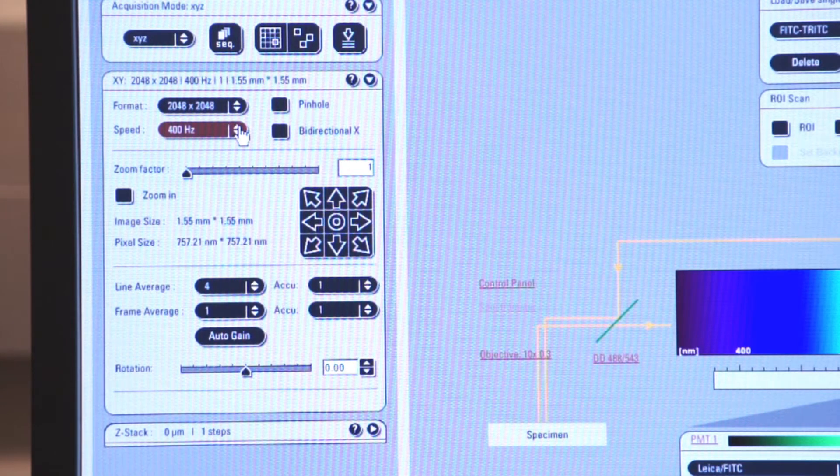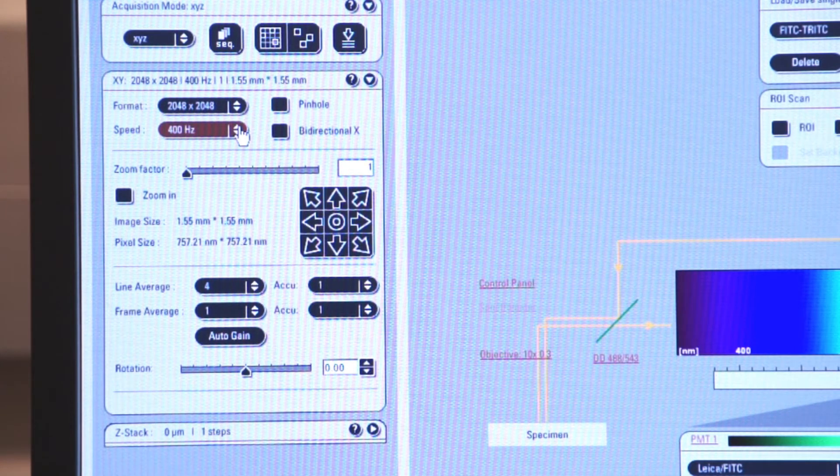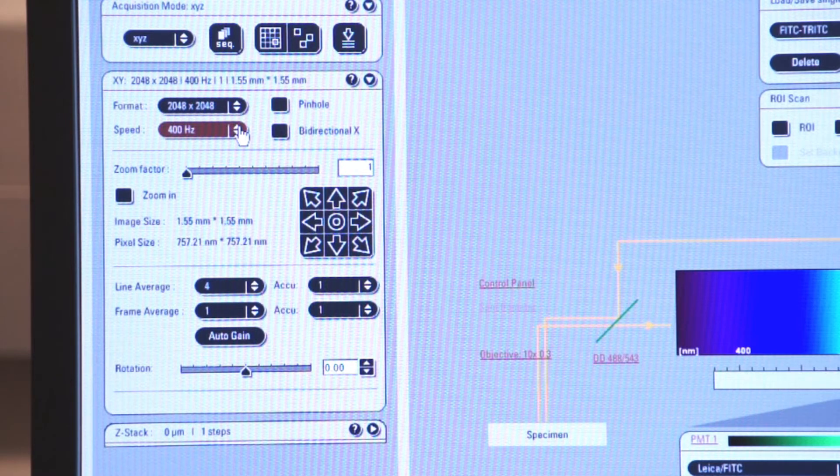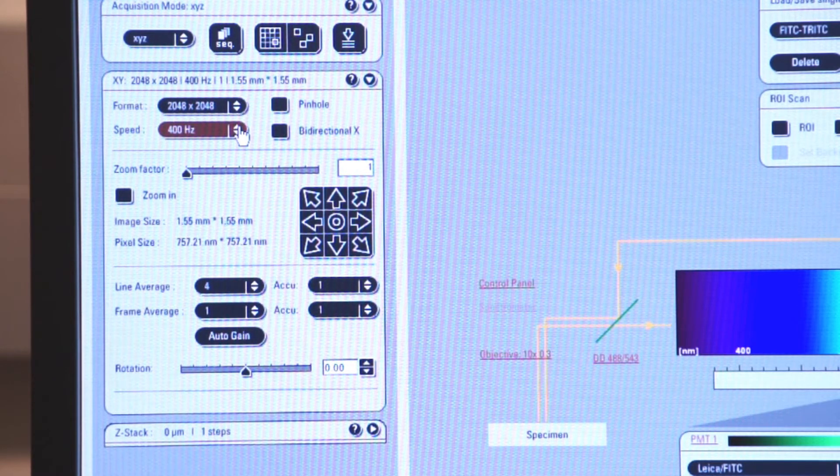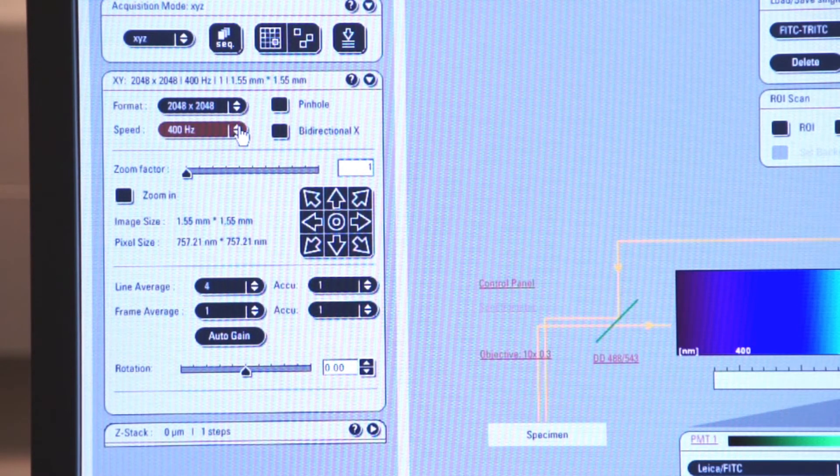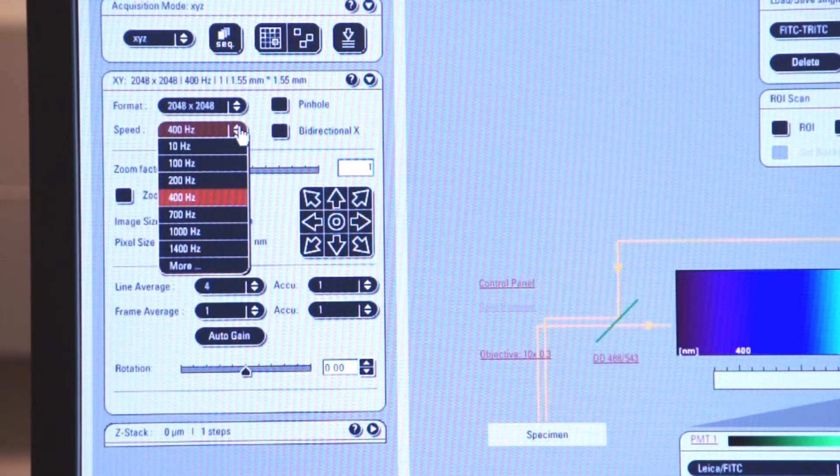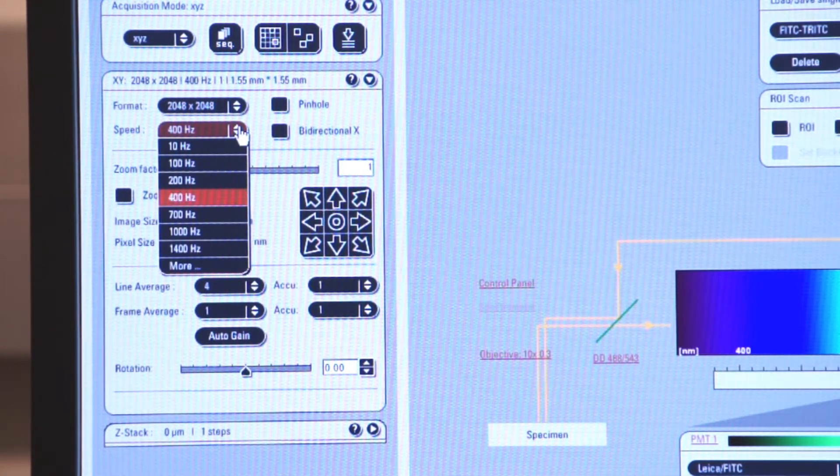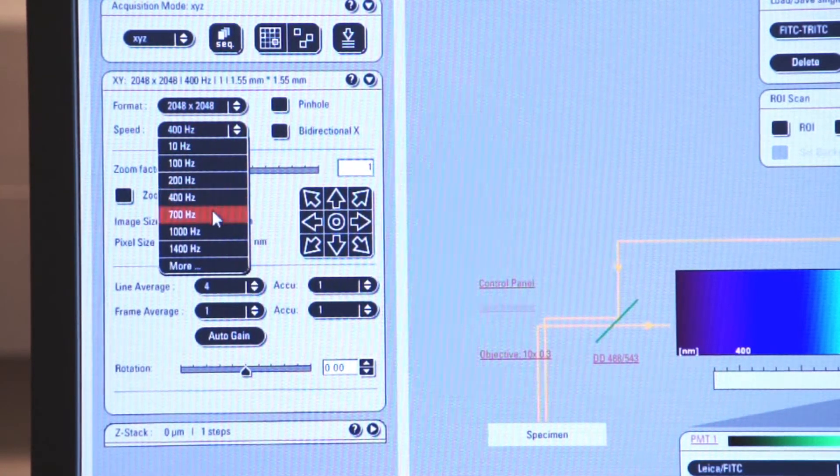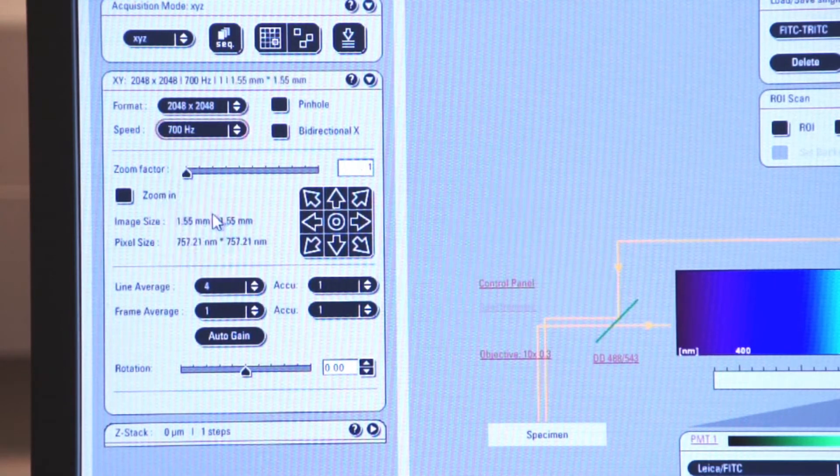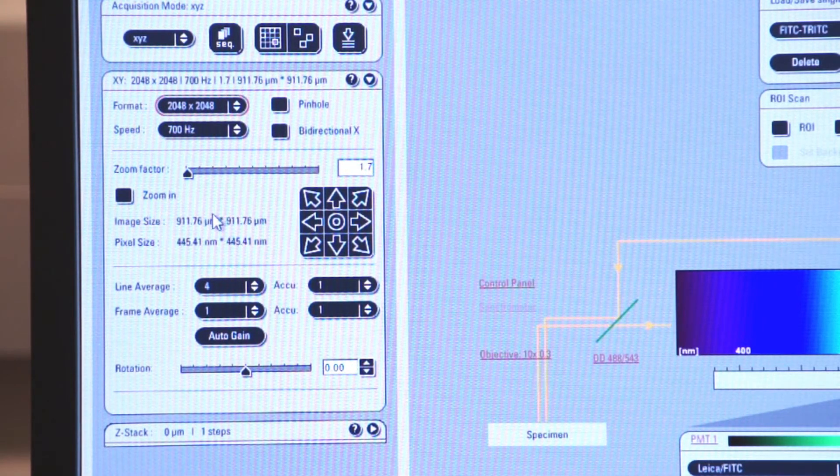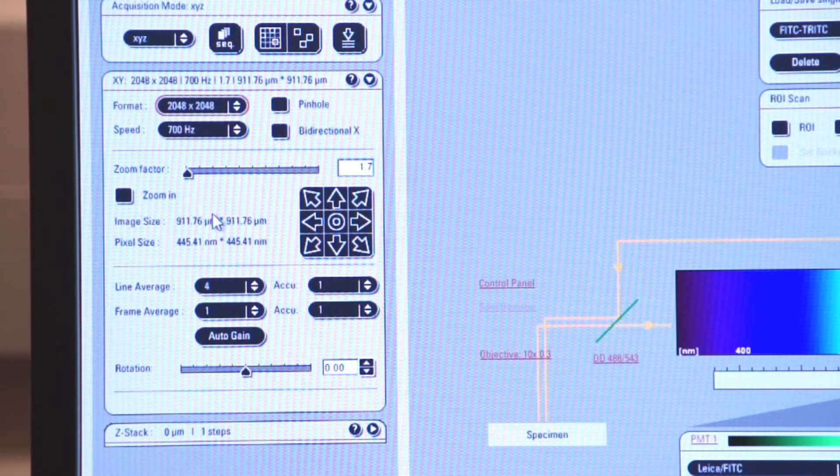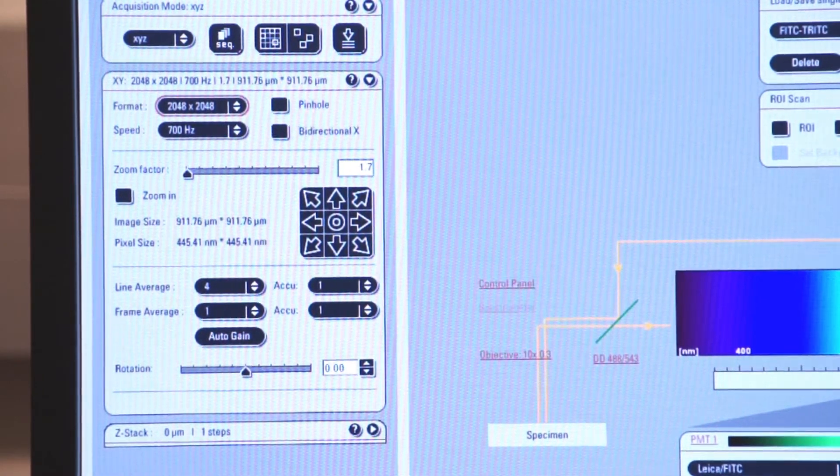particularly when we use line average to average out all the noise. In order to increase the speed of the capturing of the image, we can increase the speed of the processor. So we've been at 400 hertz, let's go to 700 hertz and we'll capture an image again and we'll watch how the speed of the capture increases as a result of speeding up the digitizer.